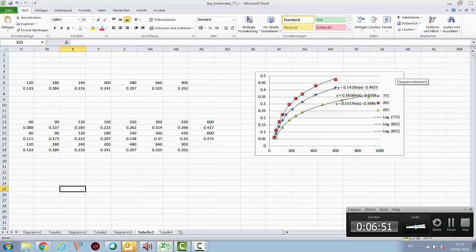But we can see they are curving off, but we probably can't see where they're going to get to. Somewhere around 0.6, maybe 0.55 probably. But it's a little bit hard to tell. No, it's a lot hard to tell. So that shows that I probably should have measured it for longer. That might be something to do with the last set of measurements, but the first thing that I'm going to do is measure the caffeine concentration when I get back into lab. That is the best thing to do with those samples at the moment.